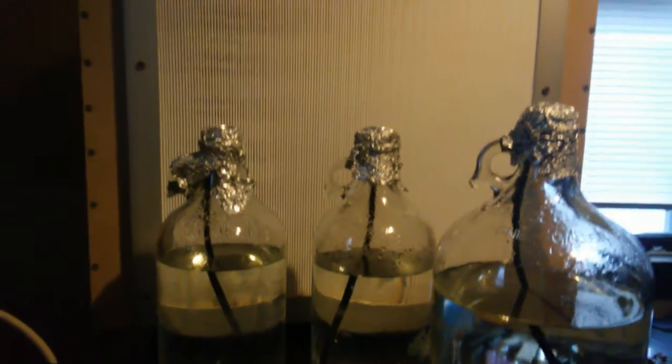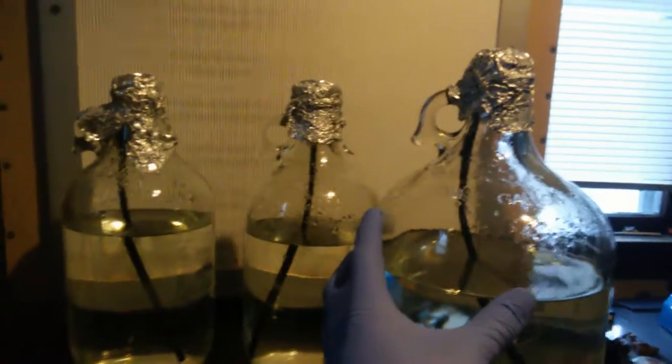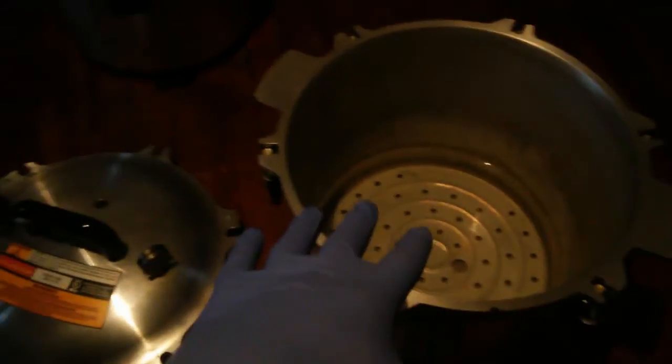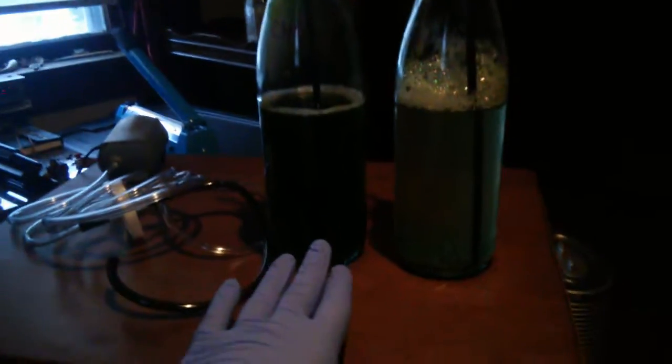We're here in the home lab in front of the flow hood with three photobioreactors: one one-gallon and two half-gallon units. They're not filled all the way but have nutrient solution in them. They just came out of the pressure sterilizer and cooled down overnight, so they're ready for inoculation.